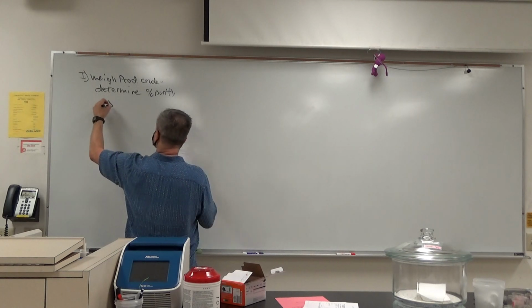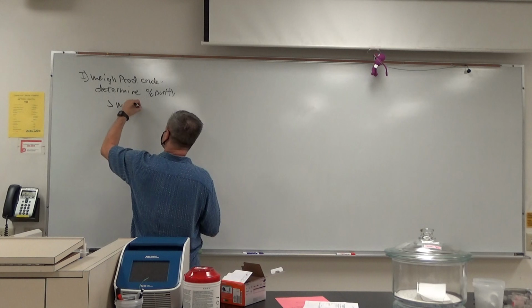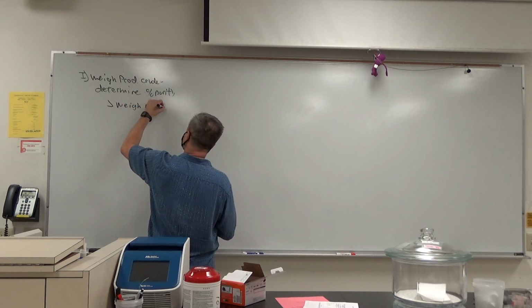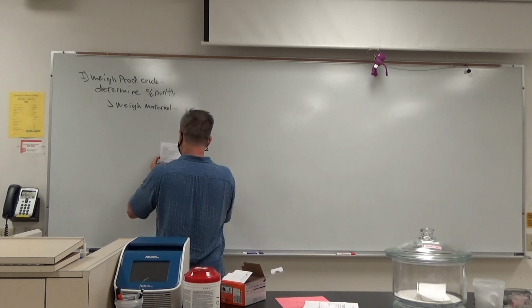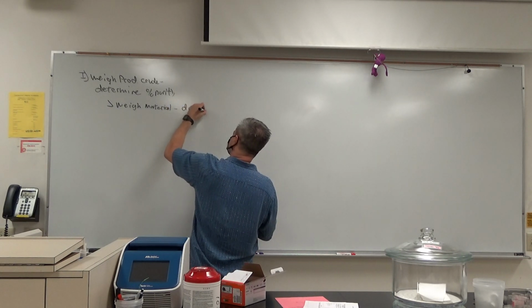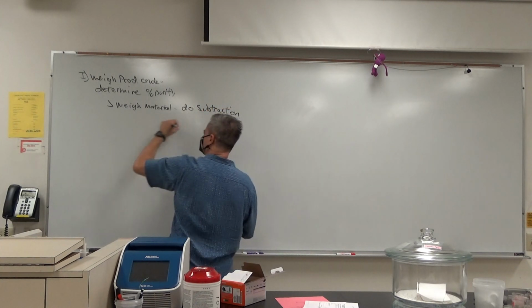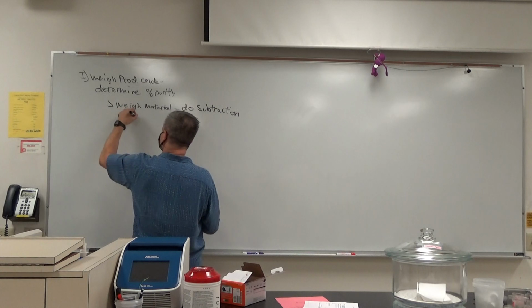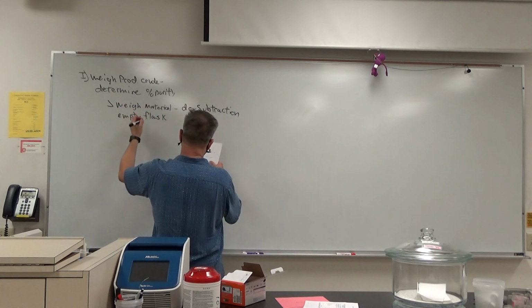So the first thing is to weigh the material, and the empty flask.